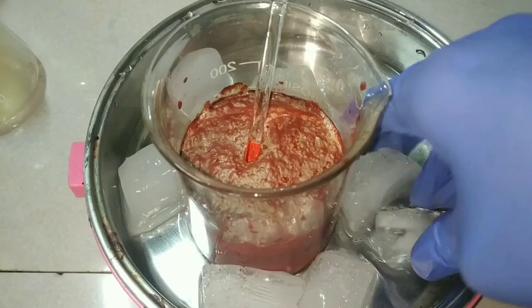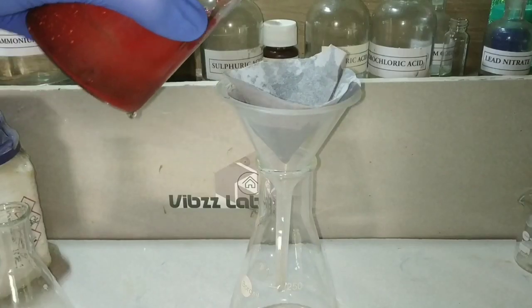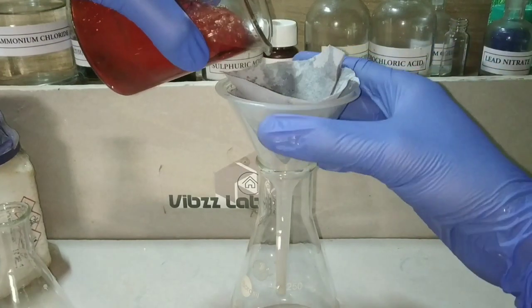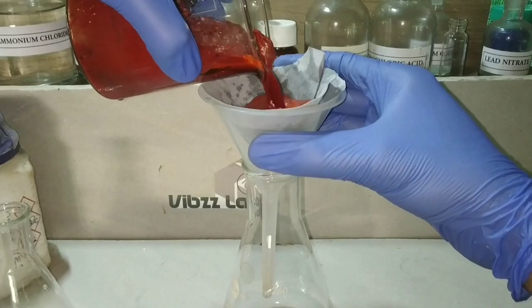Now we filter this precipitate to obtain the crude product. I am using gravity filtration here — if you have vacuum filtration that would be much faster.